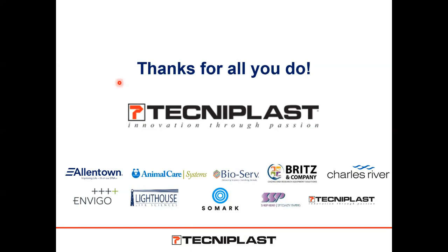Is the DVC technology available for, or will it be available for, rat caging? Elise, this one is another good question, but all the questions are good, by the way, sorry. This is something that we are exploring at the moment. The answer is no, we don't have anything available at the moment, but we are trying to understand if the DVC technology itself, with the board and the sensor, can work with the rat. This is something that is in our pipeline for product development.